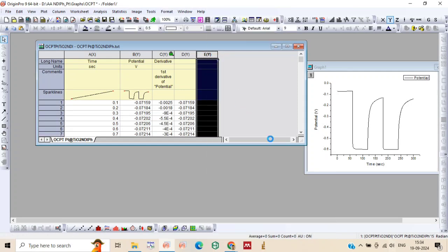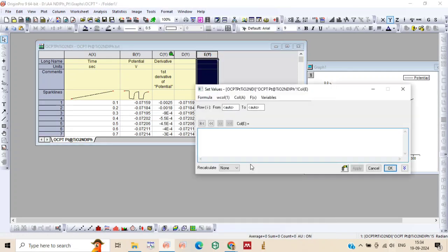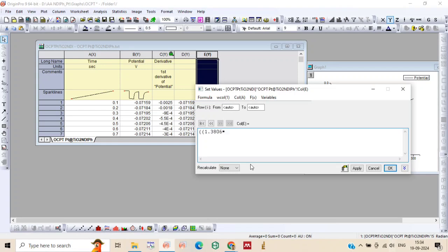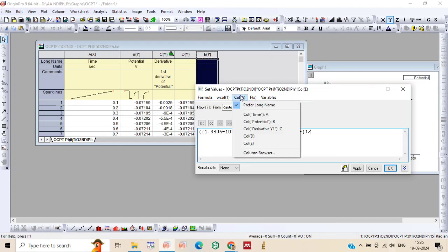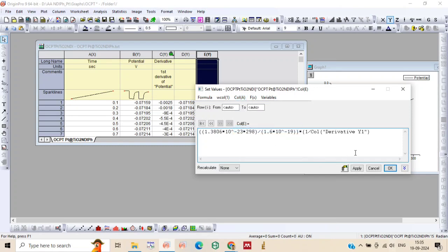Just set column value by taking the values in bracket. 1.3806 x 10 to the power minus 23 x 298 bracket close. Now divide it by 1.6 x 10 to the power minus 19 bracket close. And take another bracket. That is one by column C bracket close.